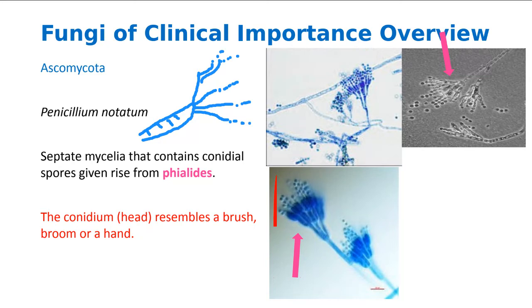So can you all, if you look at this structure right here, see those structures that I tried to draw, although it doesn't look very good because I'm not a very good drawer. Okay, well, let's practice. Okay, so let's practice. What is this thing right here? What is this thing right here?